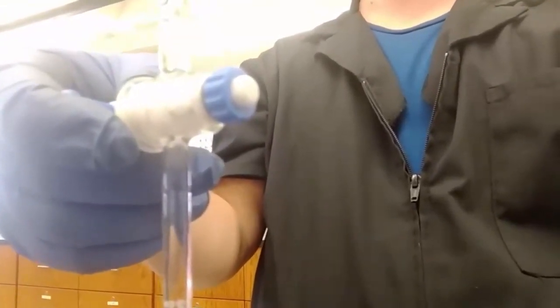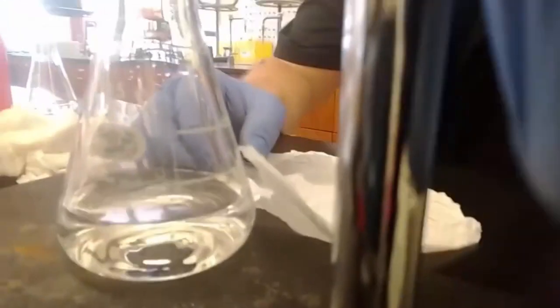And now, flask number two in. Valve on. For 17 milliliters, right? It was a little over 17. So instead of 2.59, I've got to go to 19 point something. So I can just let her rip. Full blast. 18. Just in case. I'm slowing down at 18. Now swirl, swirl, swirl. Still colorless, as expected, for not quite adding the right amount.